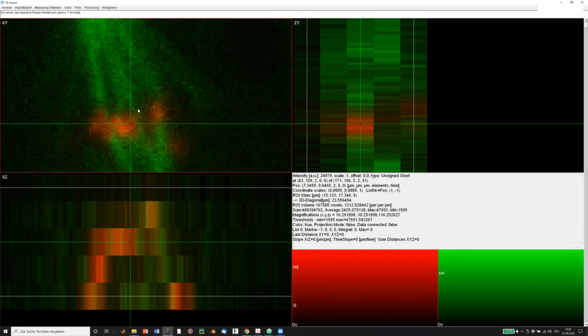There will be other tutorials that show you how to save your data back into ImageJ and therefore then later on back to the disk.